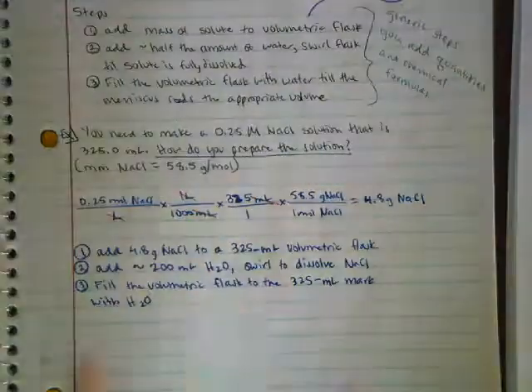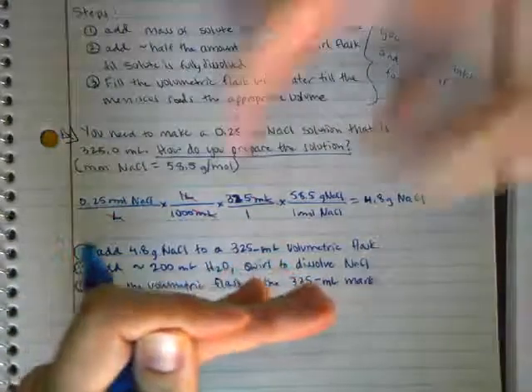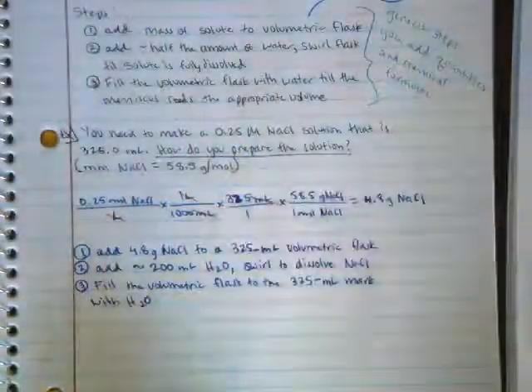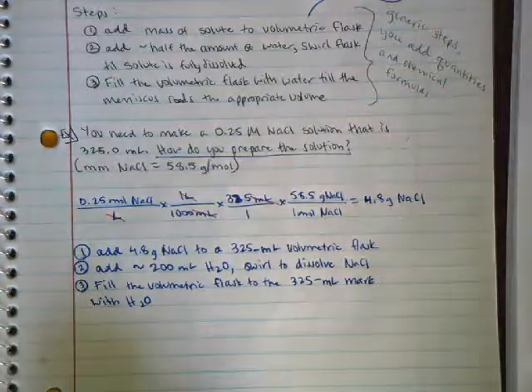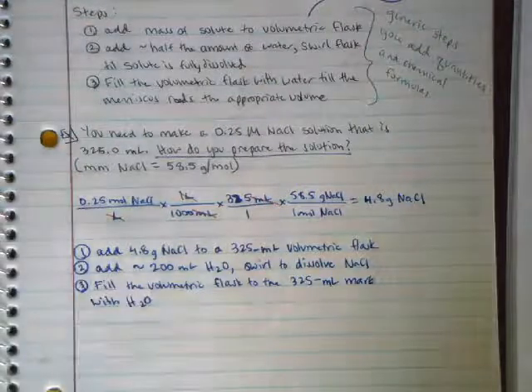But if you do it backwards, if you fill it with 325 milliliters of water and then you add your salt on top of that, your volume will be artificially increased and your molarity will actually decrease. So that's why it's very important to know the order in which to make your solution.